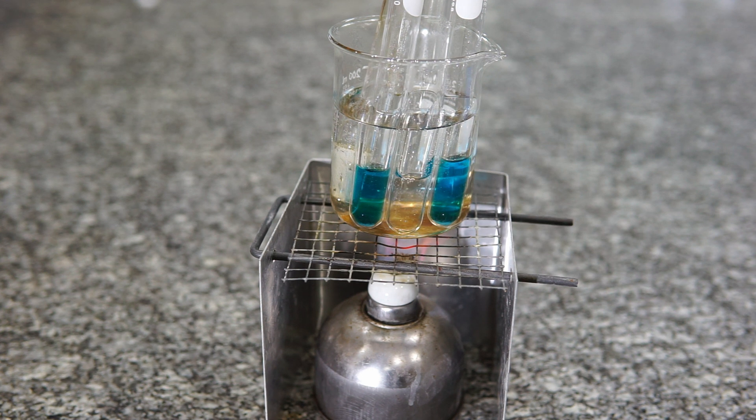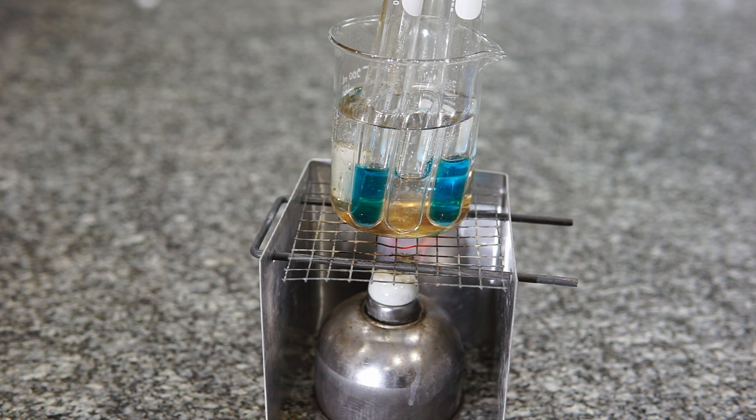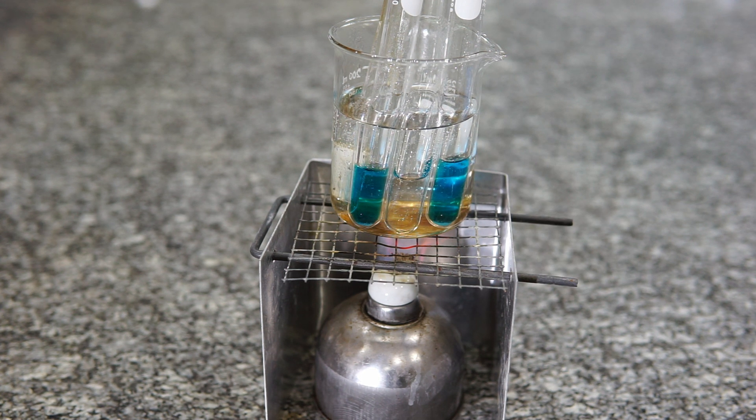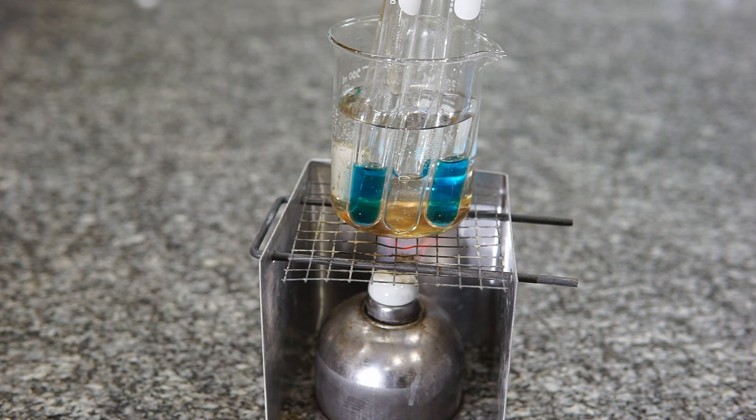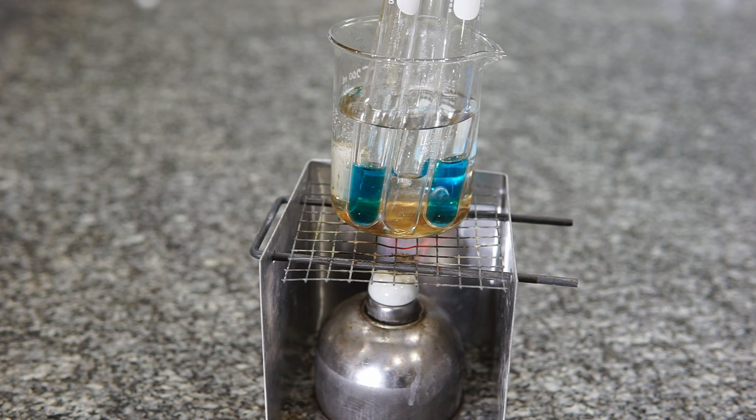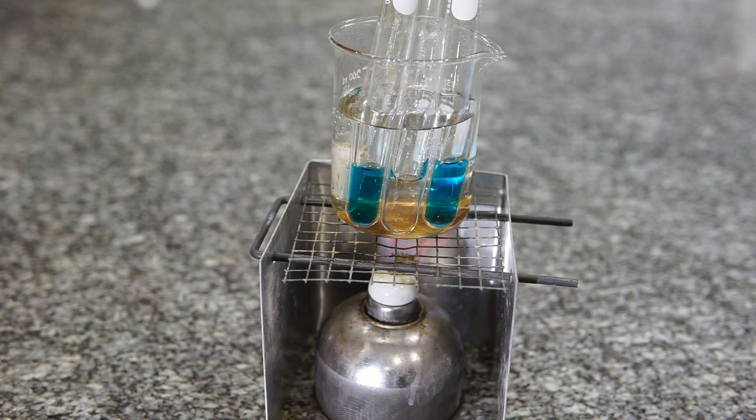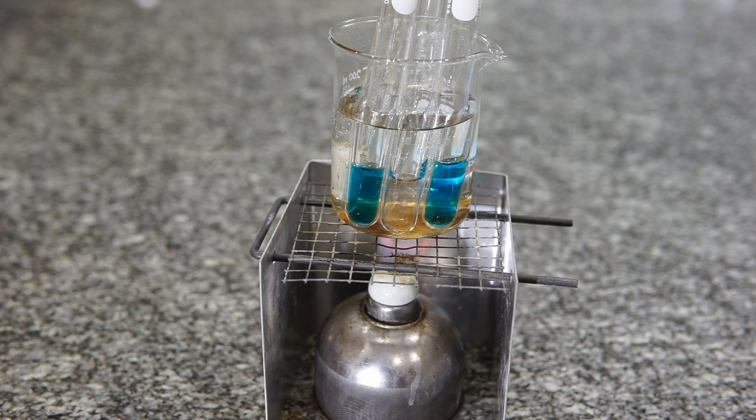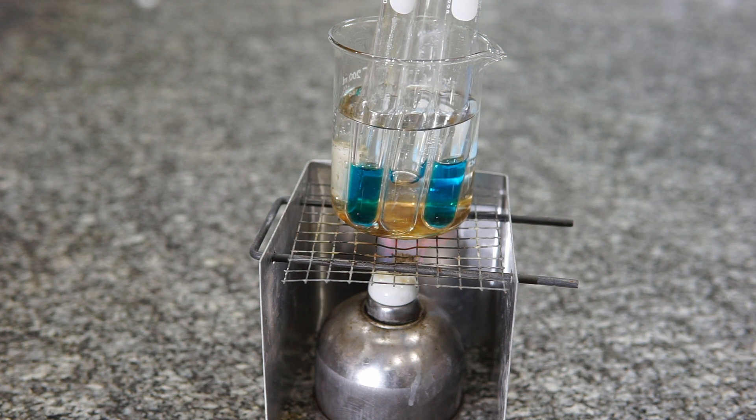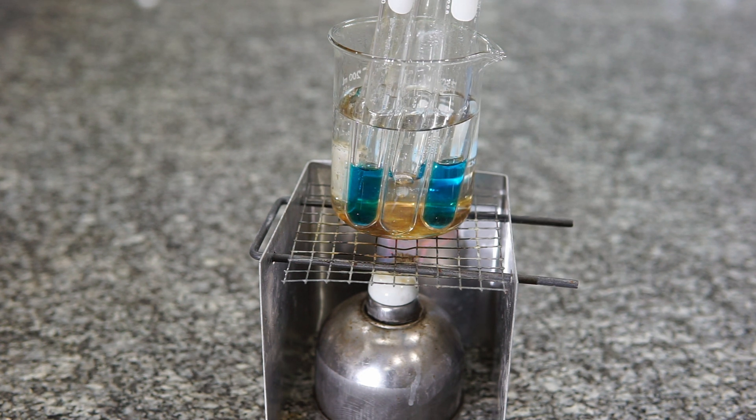One thing you should have noticed is the Benedict solution doesn't seem to have reacted at all. Now the Benedict solution should also be able to detect a redox reaction and should have changed color. Basically, the solution I used was probably a little bit on the old side - I think it decomposed a little bit and some of the key ingredients aside from the copper sulfate were no longer present, which is why it wasn't reacting.